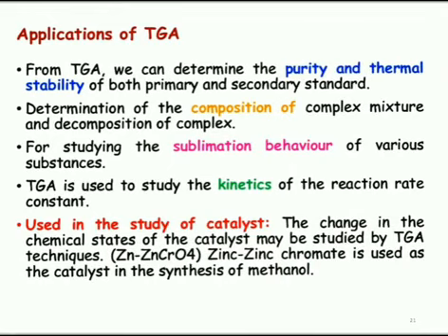By using TGA, we can determine the purity and thermal stability of both primary and secondary standards, and it is also used to determine the composition of complex mixtures and the decomposition of complexes.